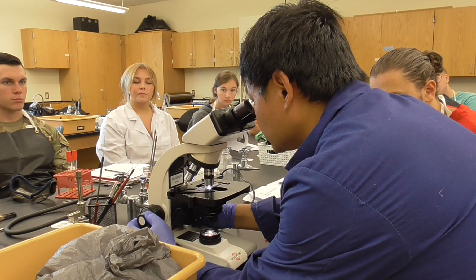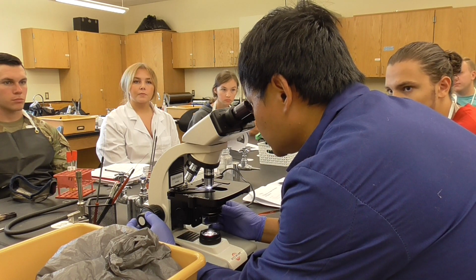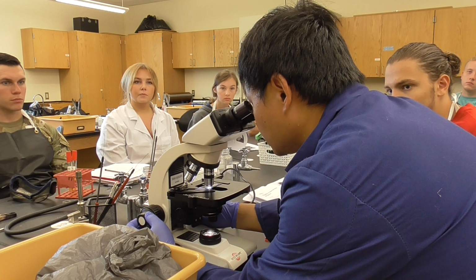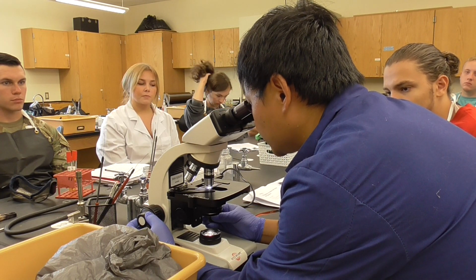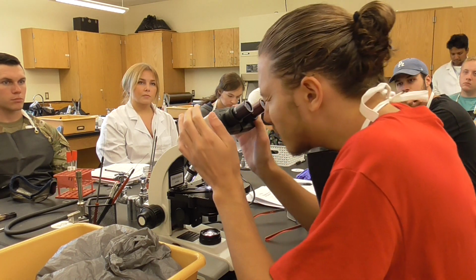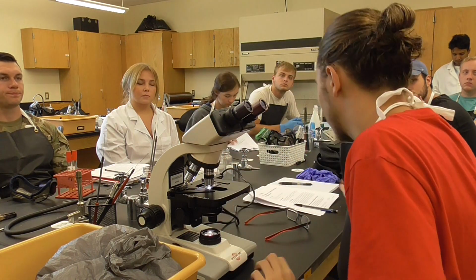Maybe. No, okay, we can see it. But seems like this is not really a bacillus. This is maybe coccus or something. You can see some. There's a bunch of bacteria there. And yeah, so you can see it. Can you see it? When you focus, you can just move around. Go ahead and see it.